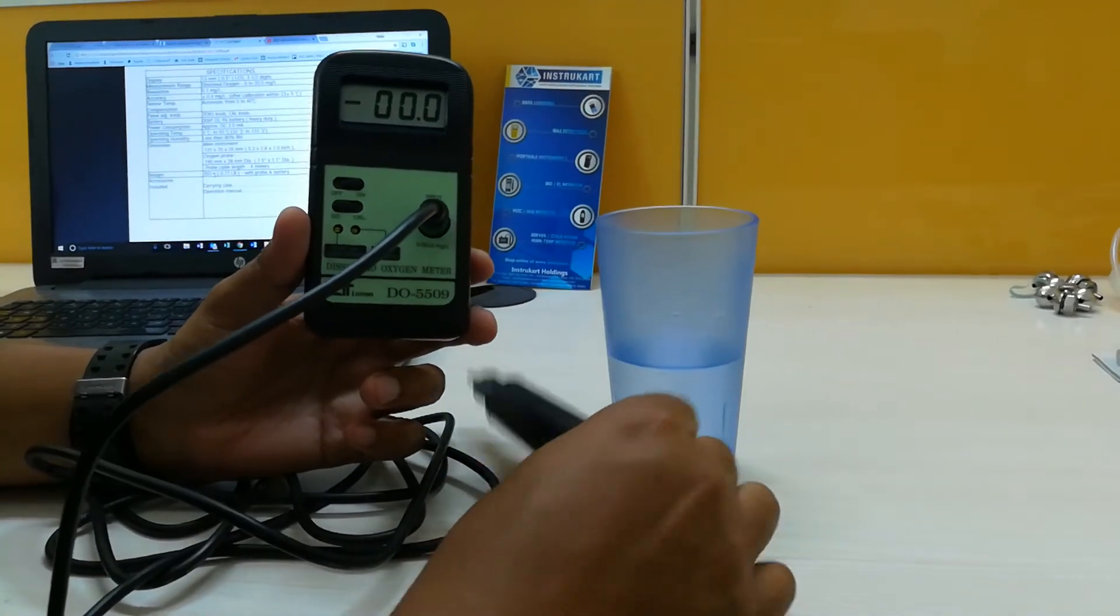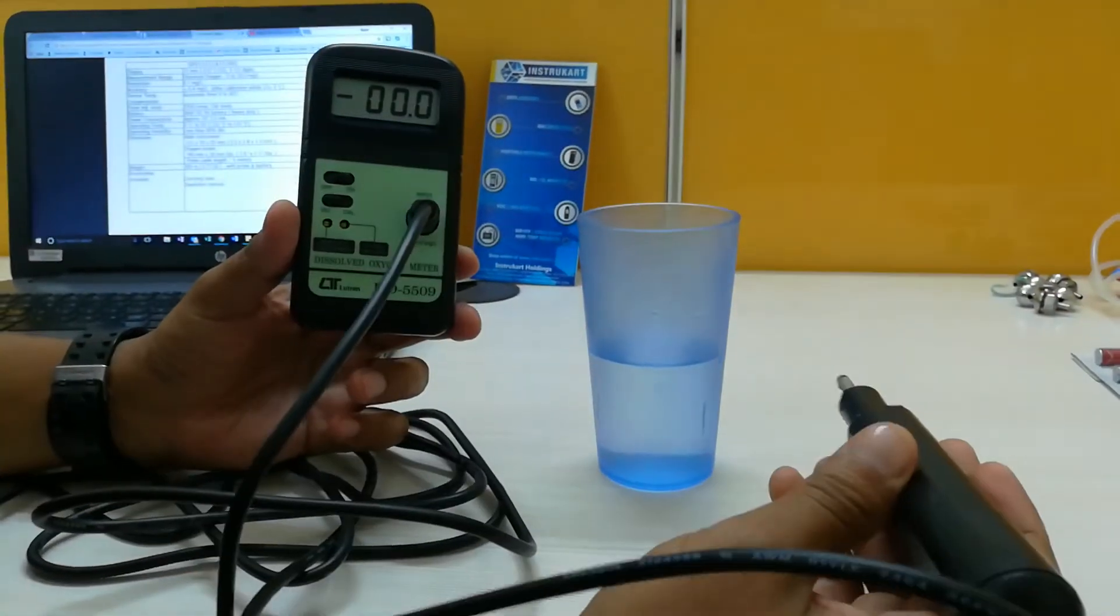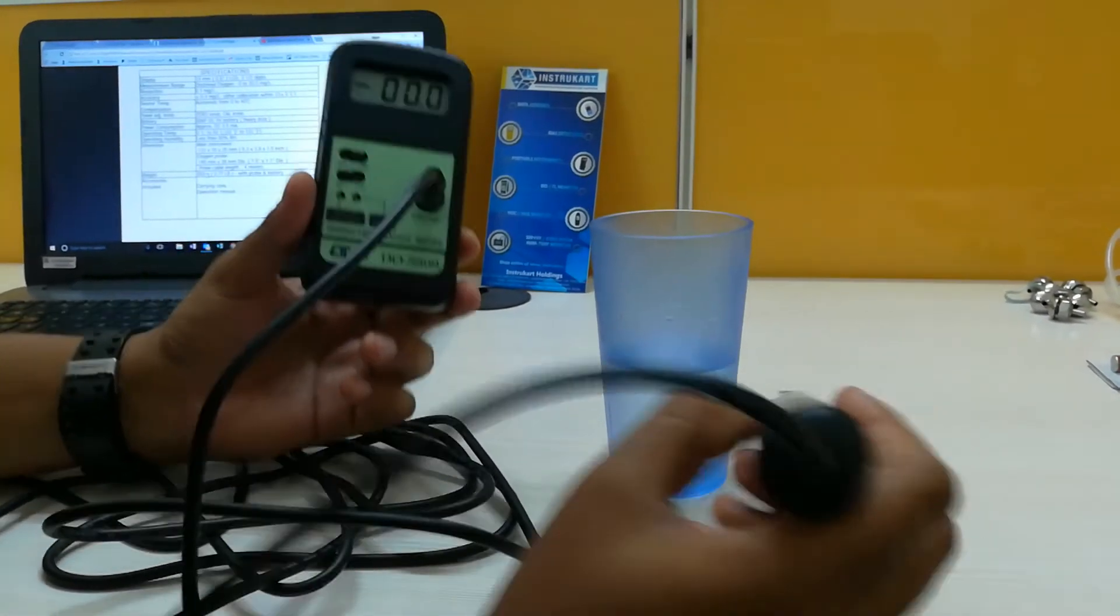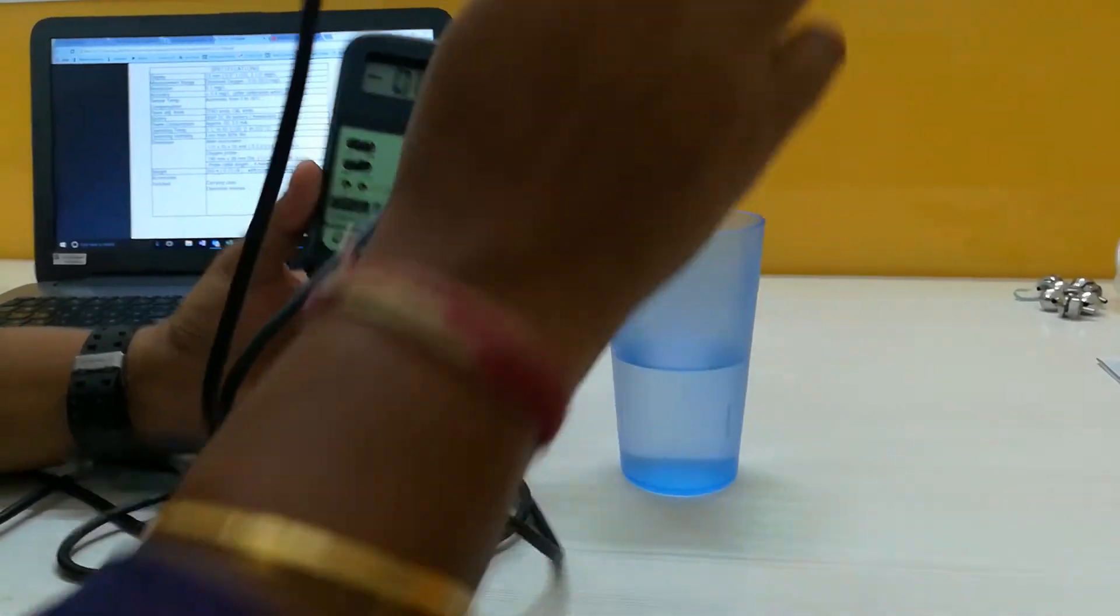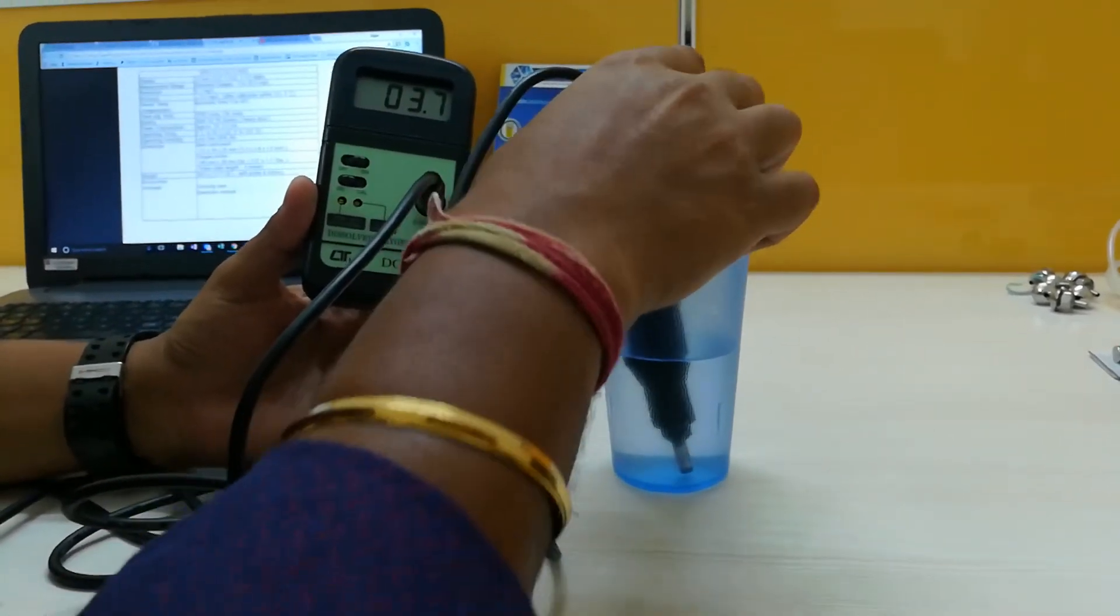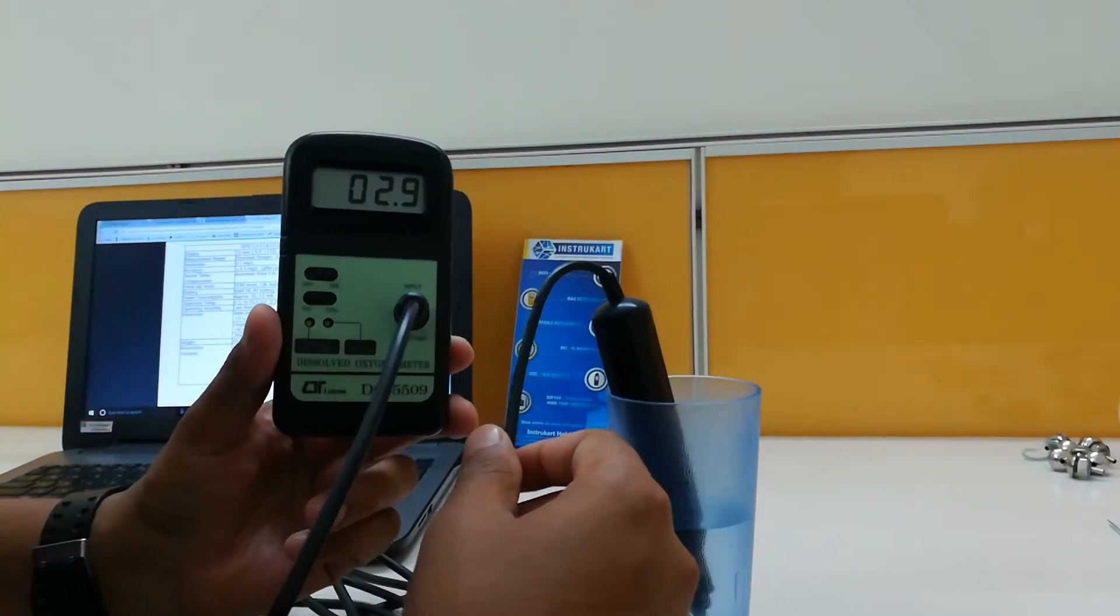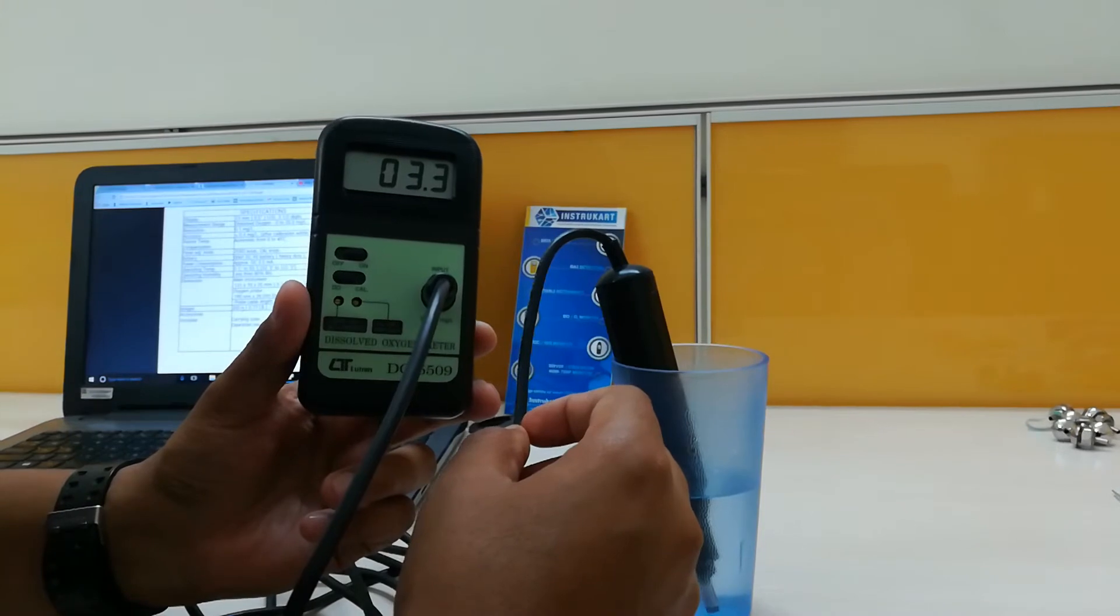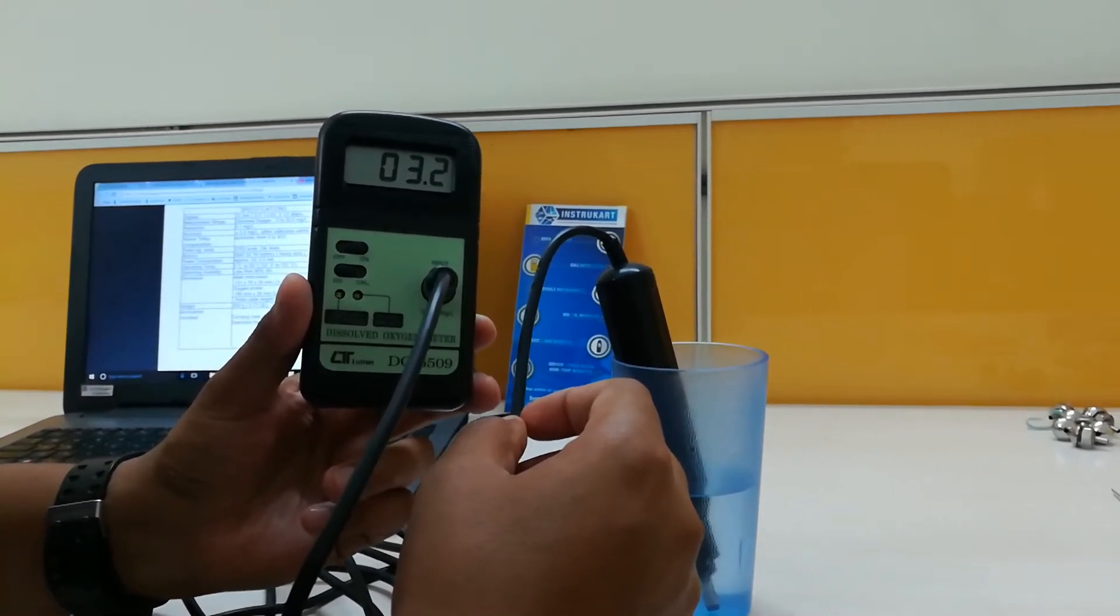We will have a look at how the dissolved oxygen changes if you put it in a glass of water. So this is fresh tap water, and we will see the change in this. You can see the dissolved oxygen level has changed to 3.3 mg per liter.